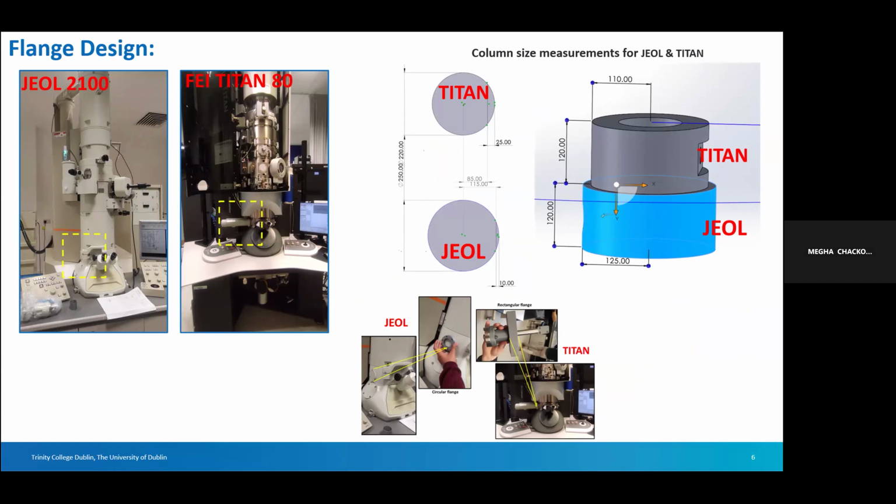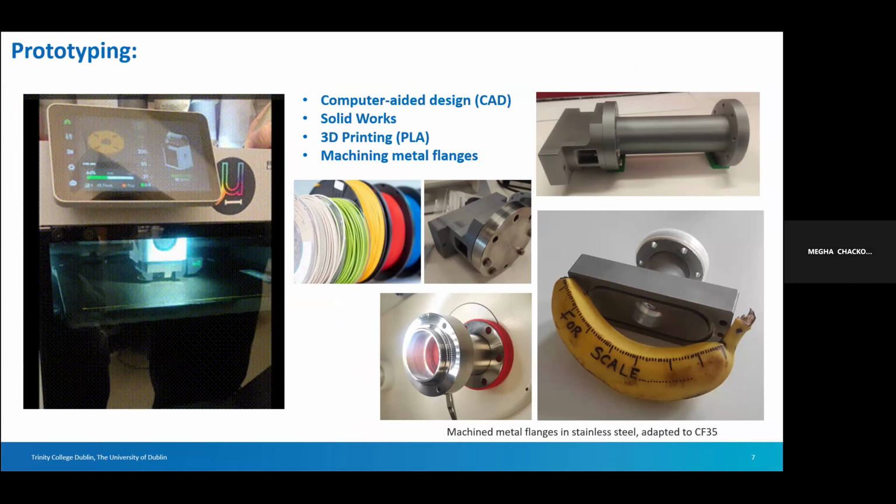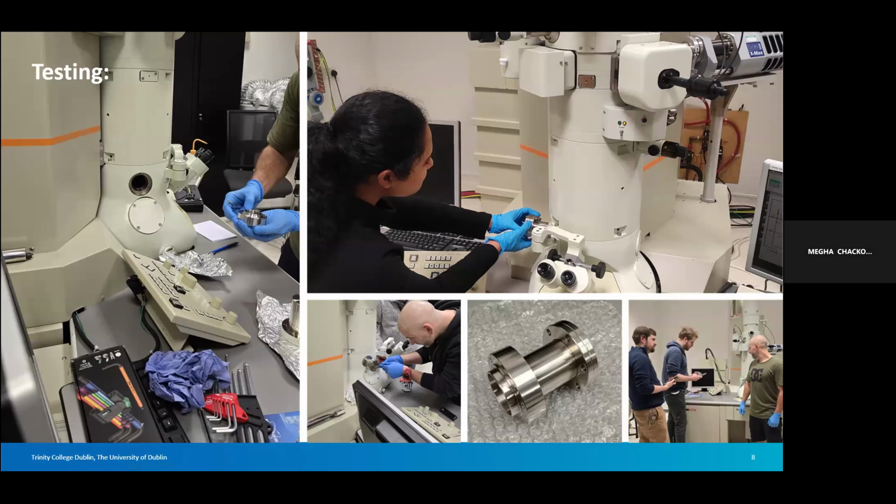To prototype these flanges, we have already started comparing the column sizes of the instruments available in the Trinity labs, which are JEOL and Thermo Fisher Titan. We have compared the column sizes and the flange. We have made a round flange design for the JEOL and a rectangular flange design for the Titan. We have also used 3D printing to print these designs with the 3D printer available in the labs. Once we finalized the designs, we moved into machining. We machined the flanges in stainless steel.